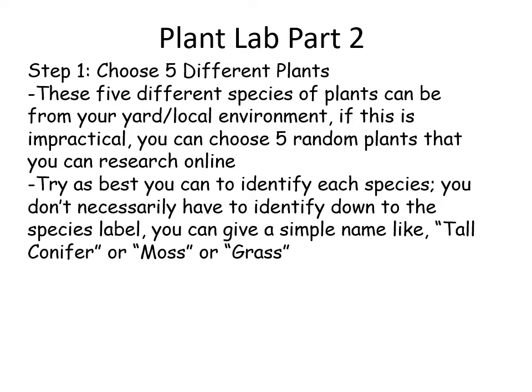In next week's lab, we're going to create some family trees, some phylogenies, using the traits that we figure out in this lab. So it's a pretty simple lab. There's 3 steps to it.